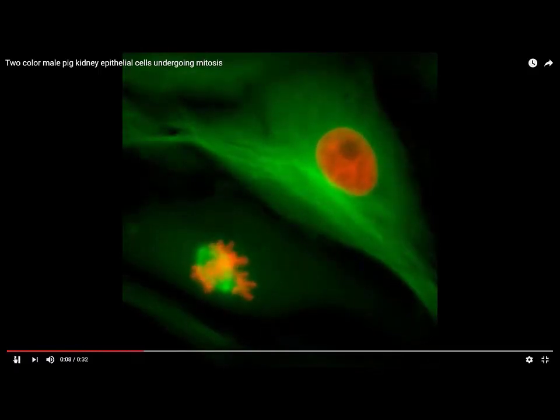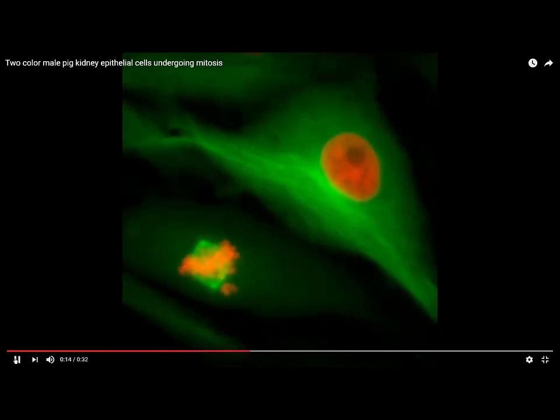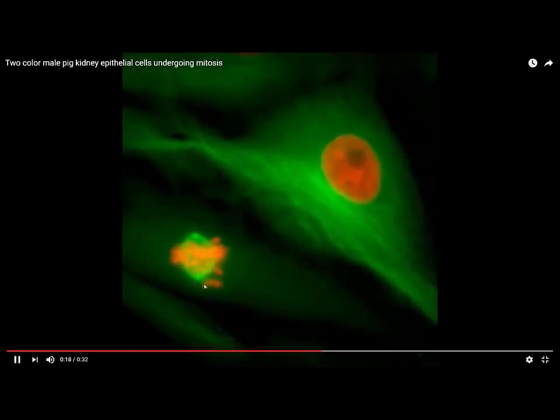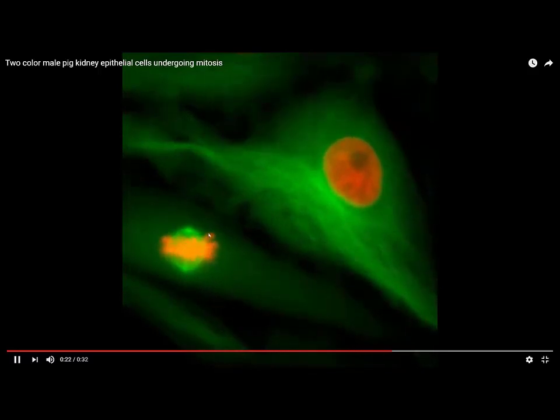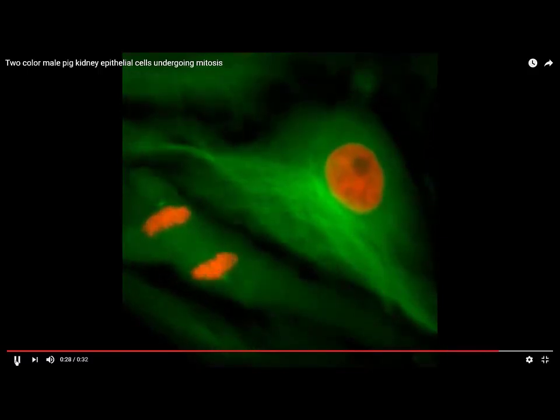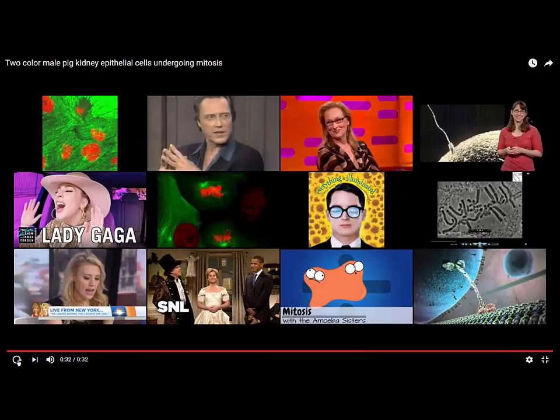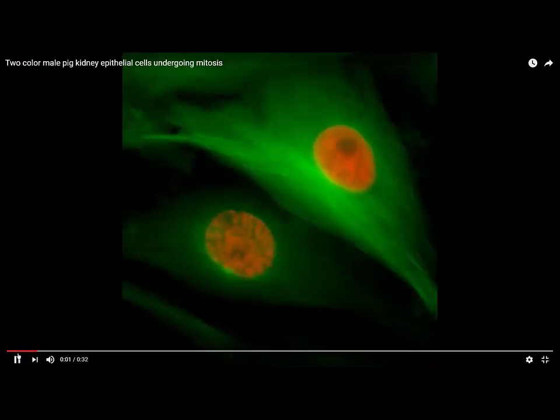And you can see pretty early on that the chromosomes get connected up correctly, so they're being tugged from opposite directions. But look at this guy down here. You see what's happening with this DNA molecule? It's not connected up correctly. It's being pulled only from this centrosome, but not from this centrosome. And so the cell actually has to wait for that DNA molecule to get connected up correctly before it proceeds to anaphase and telophase and the rest of cell division.